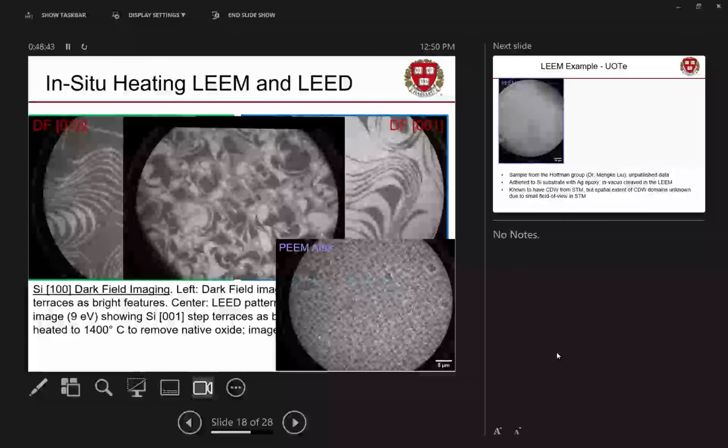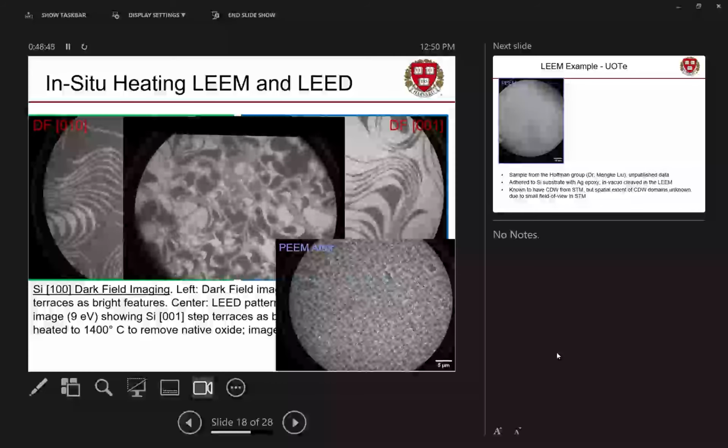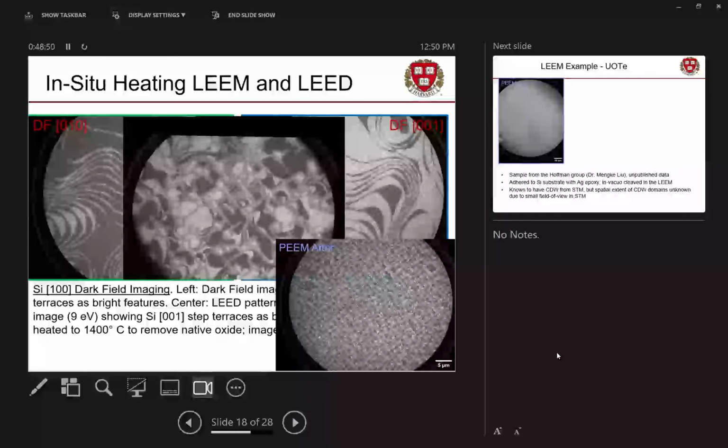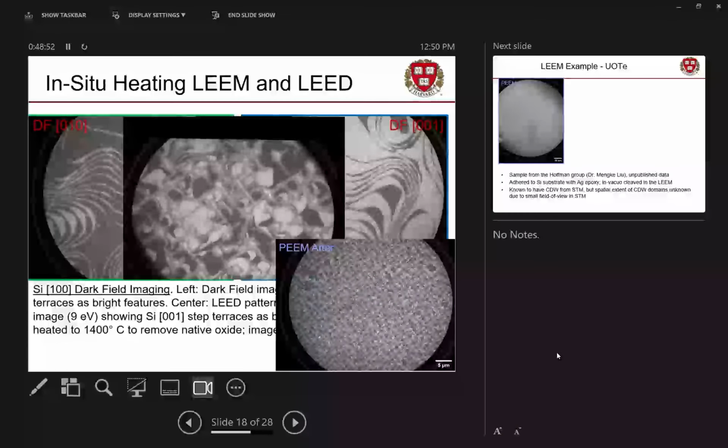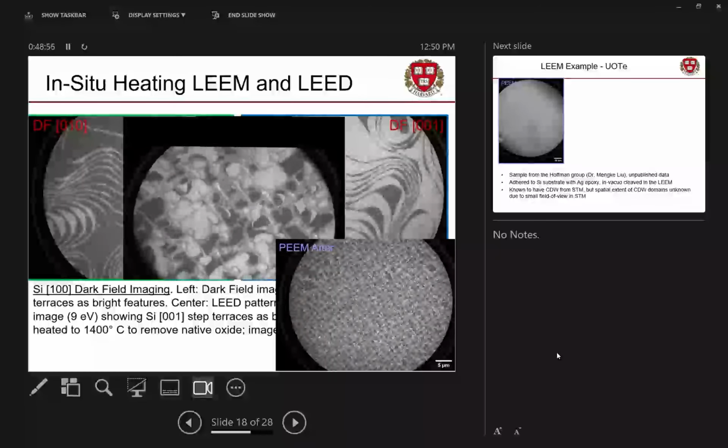Incidentally, after the fact, if you go look at PEEM, remember, we don't get contrast between different material compositions in LEEM. This is a lower mag PEEM image. You can see all these little needles of iron silicide that have grown everywhere, just to satisfy yourself. That's what they really are.